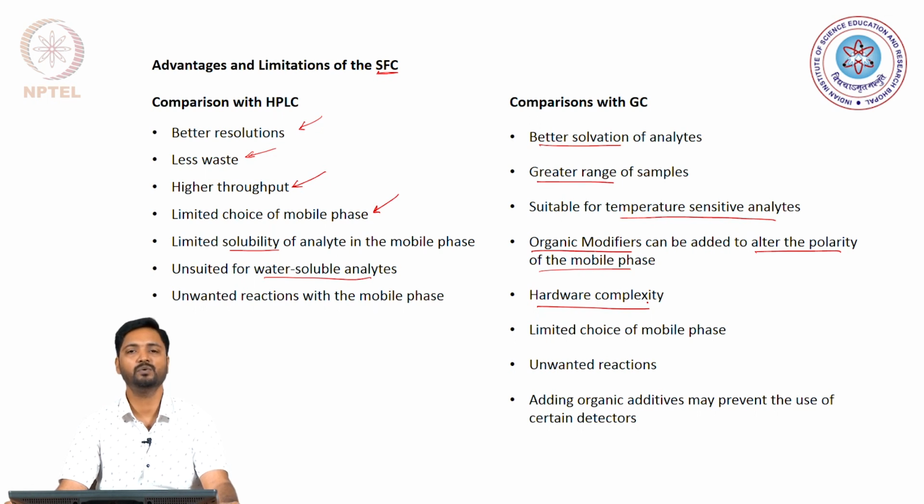So, we need to maintain or alter them in a very precise manner, so that we are able to change the properties of our supercritical fluids appropriately. This makes the hardware requirement more complex when compared to gas chromatography, and that adds to the cost of the supercritical fluid chromatography systems.